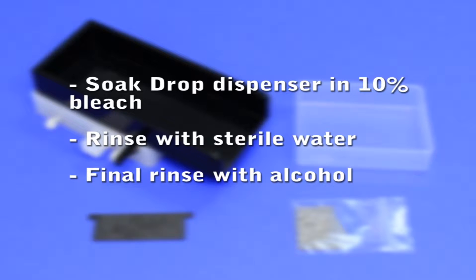It is important to clean your drop dispenser before use. First soak the dispenser in a 10% bleach solution, then rinse with sterile water. The last step is a final rinse with alcohol.